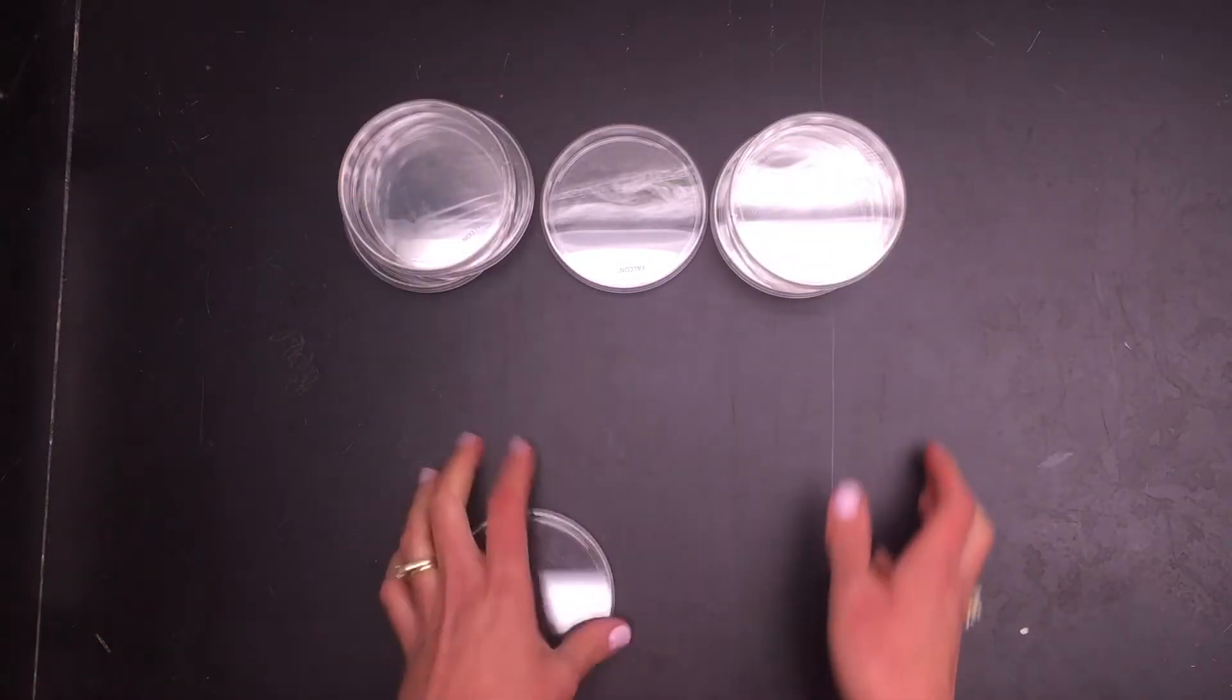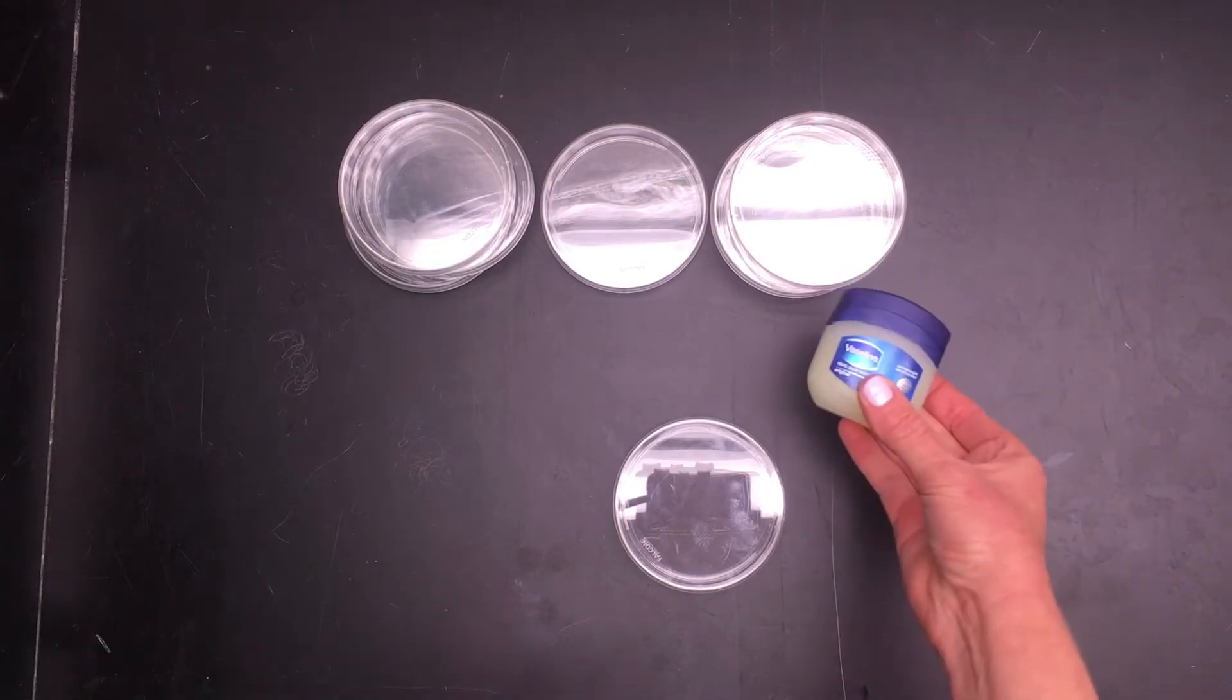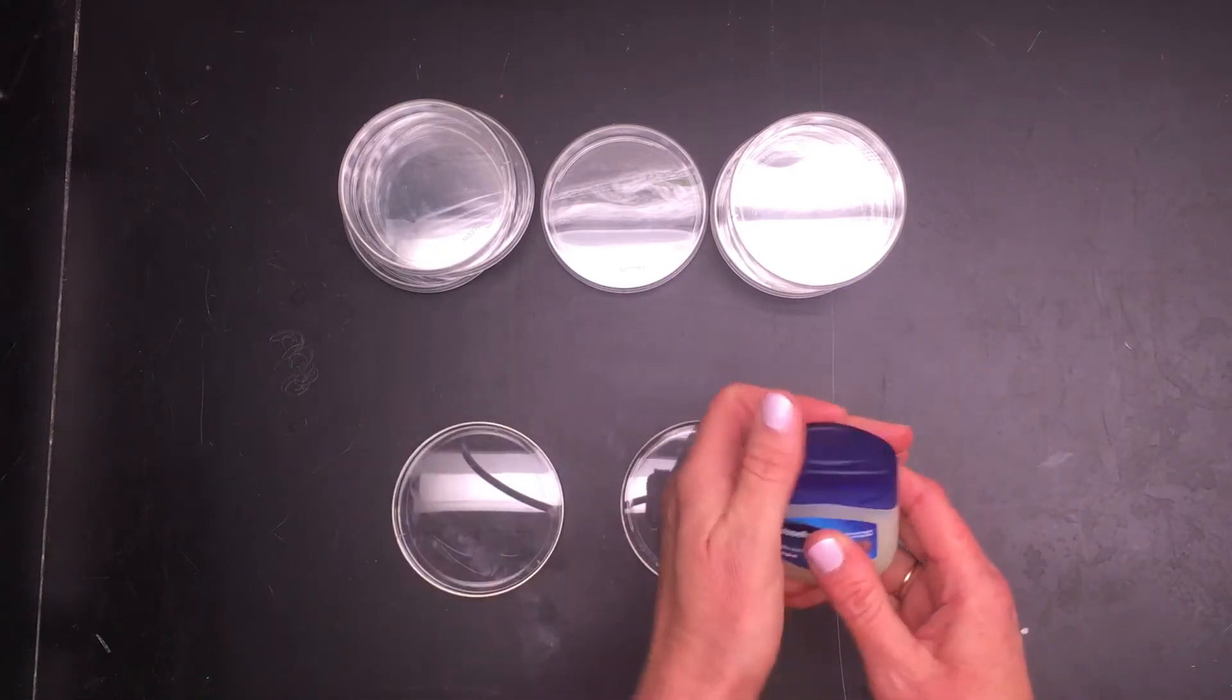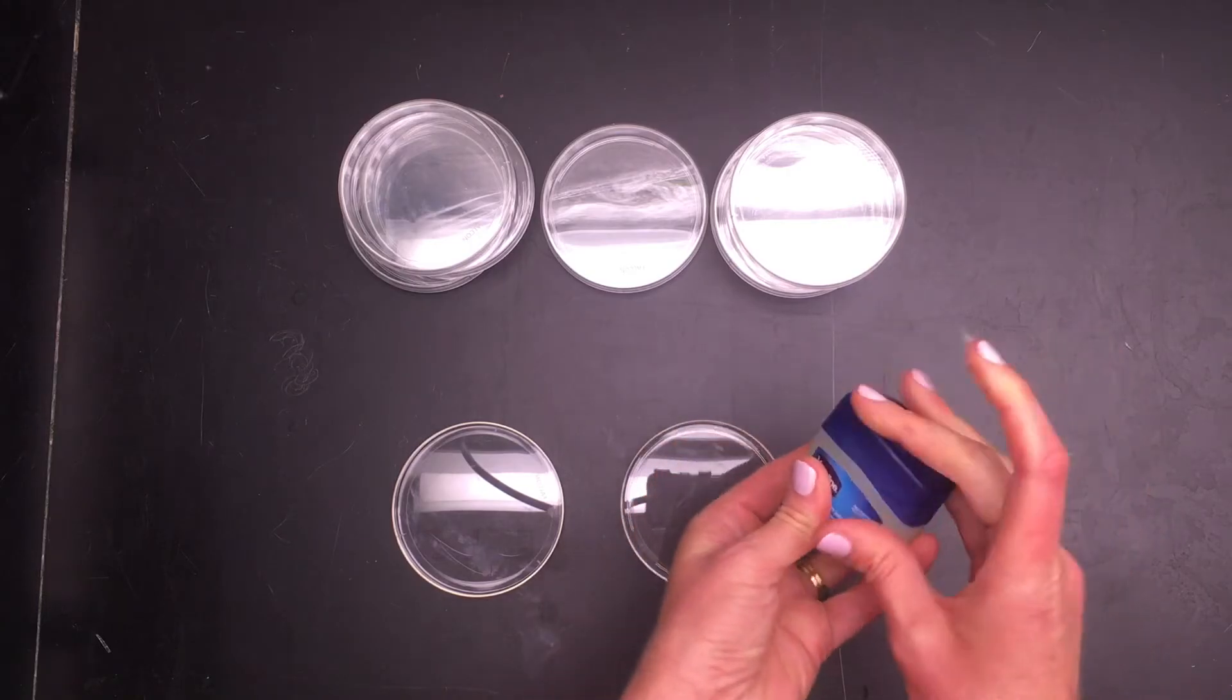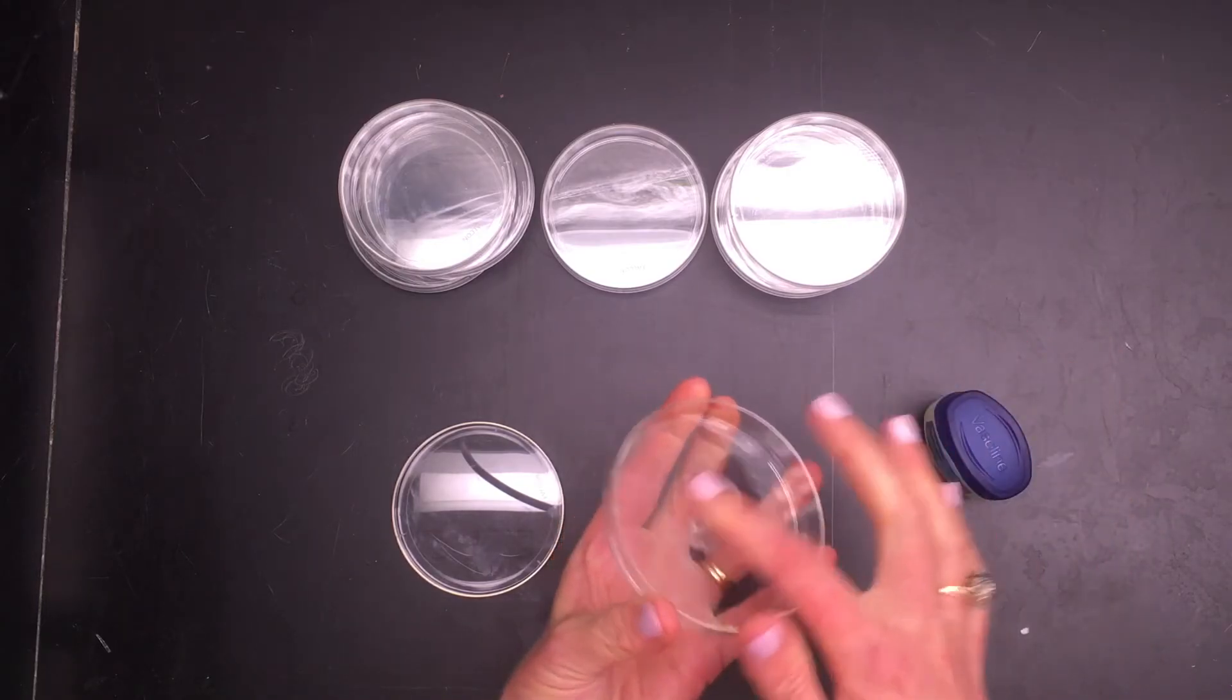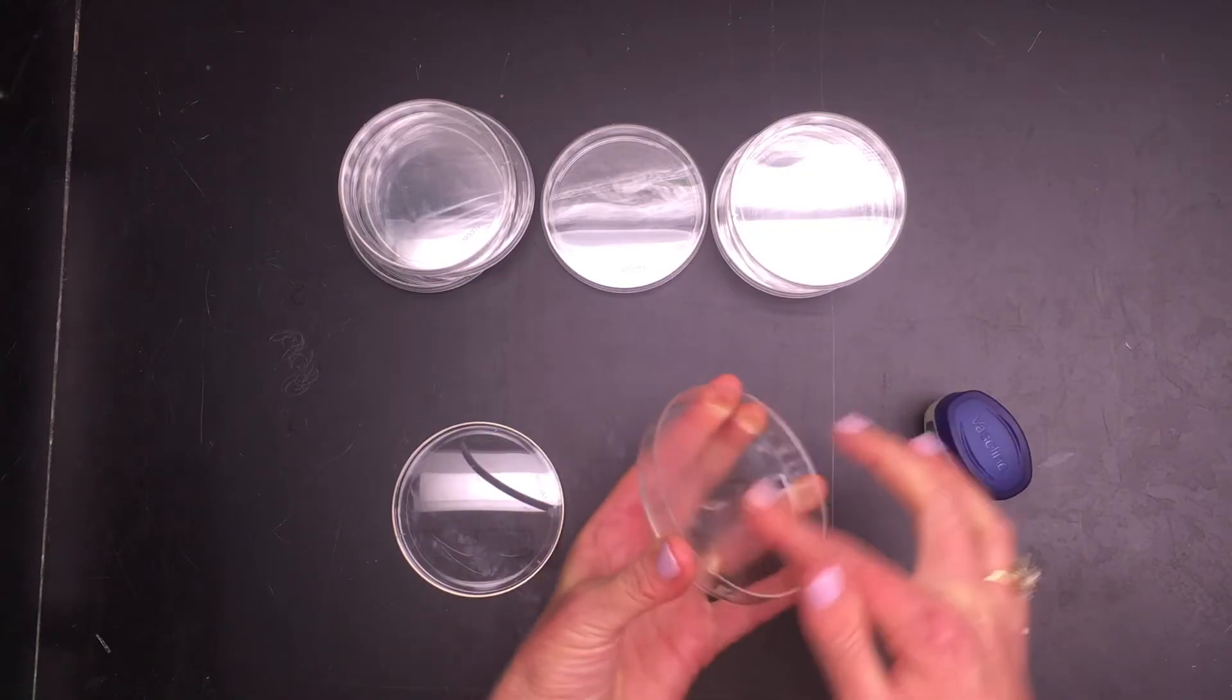So what you're going to do is take some petroleum jelly, take a very small amount on your finger, and with a thin coat you're going to rub the bottom of each petri dish.